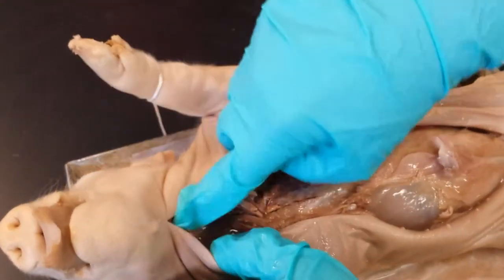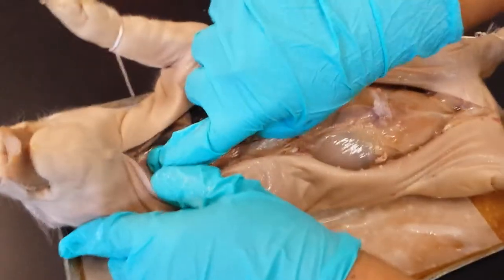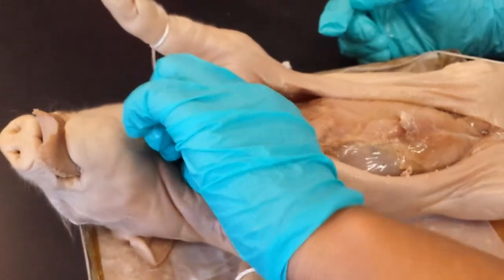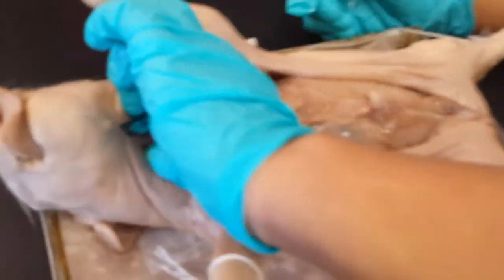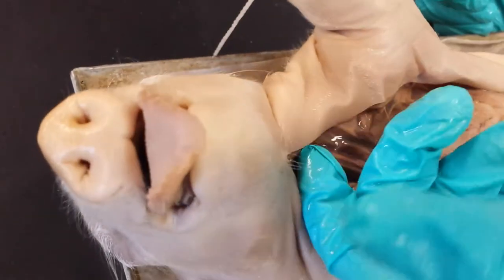You know, Carla was telling me earlier about the white thing on the neck, and she never came back to that, and I never found it. And then she told you to finger his mouth. And she told me to finger his mouth. Okay, I think I found his little Adam's apple. I don't remember this part. Check it out. I can look, it's like a little ball right here. Right there, it feels like a little ball. Oh, wait, it was EJ!